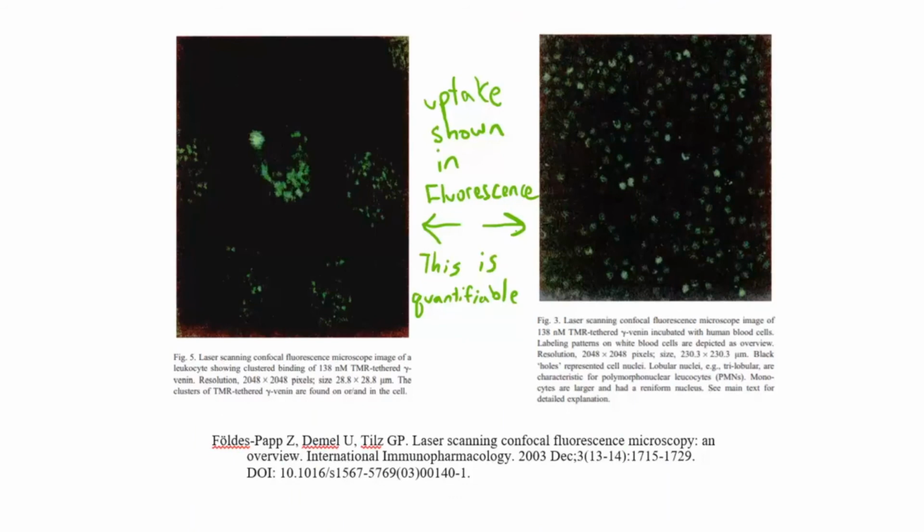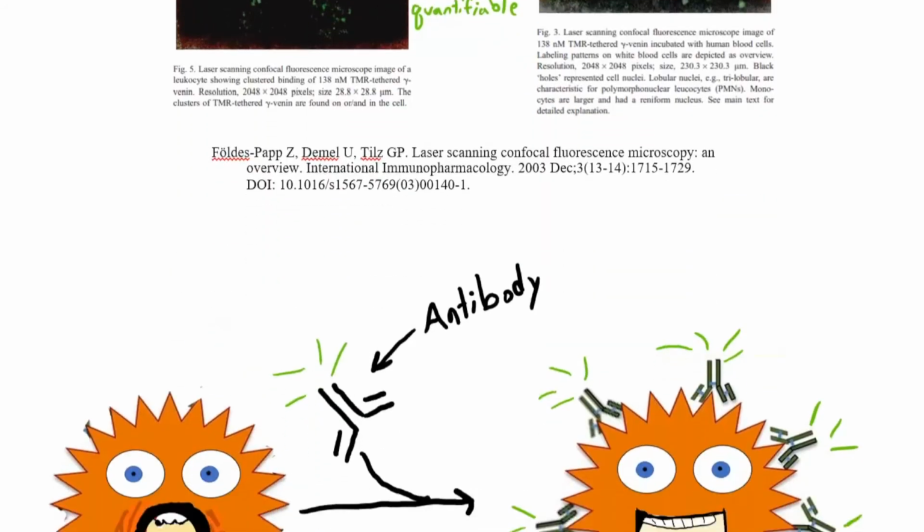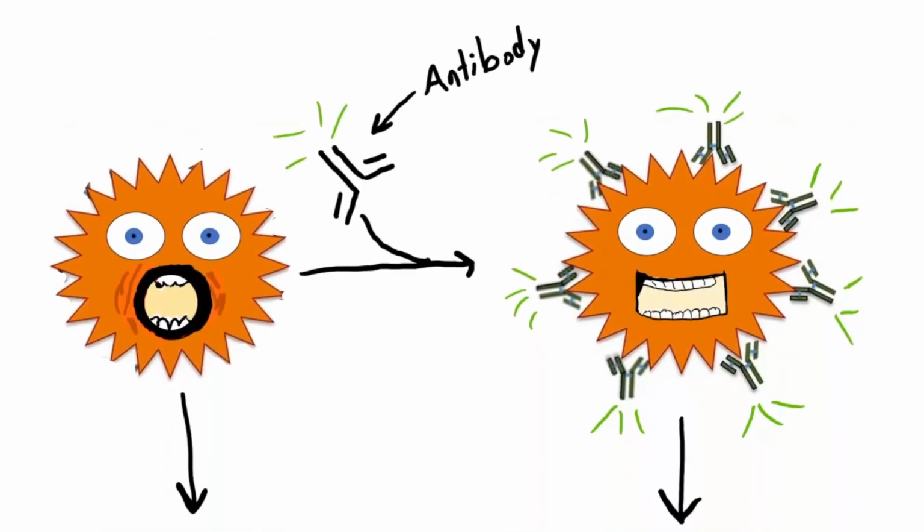This process can demonstrate the specific protein interactions in the docking and clustering of the molecule on the plasma membrane, internalization of the complex, and triggering of cellular activation. Extra info to take into account is that it is really important to determine under what reaction conditions the process can occur. To make it simpler, it is possible to tag an antibody cell with a fluorescence tag and be able to observe through the images its behavior.